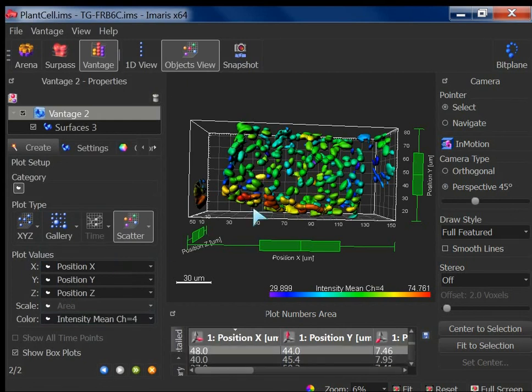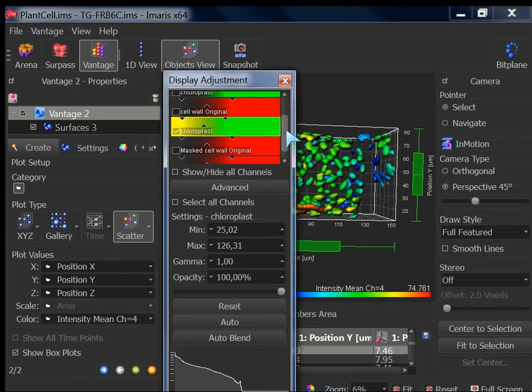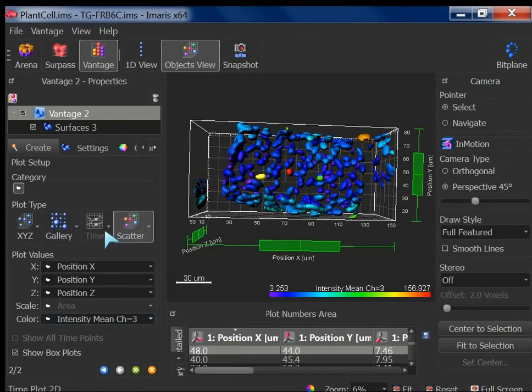Though you have original data, which is channel number 1, channel number 4, right? No, what was that? No, channel number 3 now. Oh no, I had to count 1, 2, 3. It's a bit confusing. 3. Oh, third one. But at least I know it's possible. Oh, but the numbering goes from top to bottom. It's difficult to take all the information, but I don't have a specific problem, and at least we know it's possible.